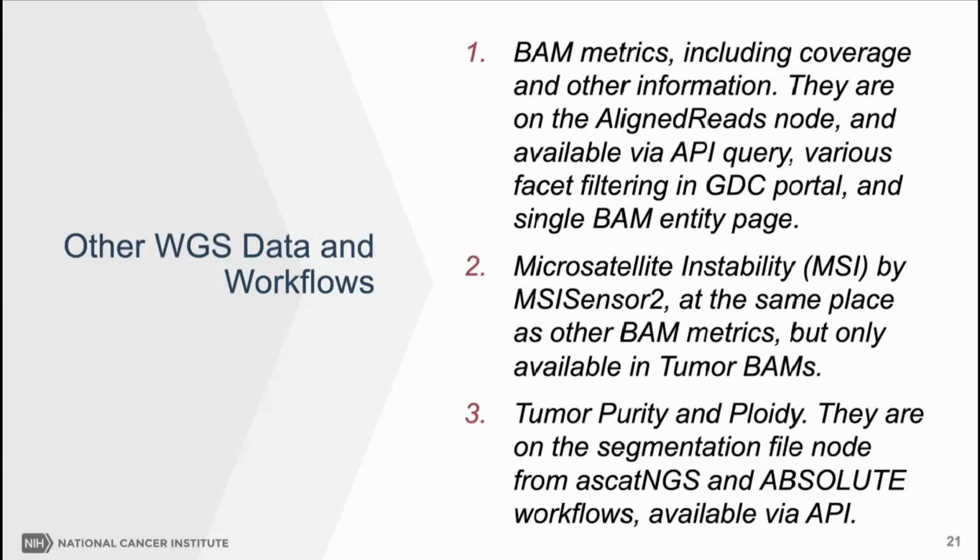Finally, we have tumor purity and ploidy estimates. As I just mentioned, it's naturally a product of any integer value copy number pipeline, for example, the ASCAT pipeline or the Absolute pipeline.